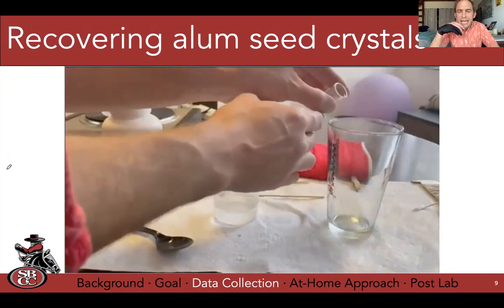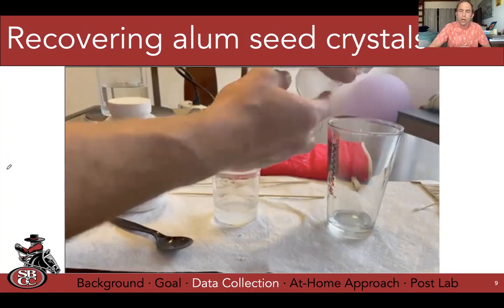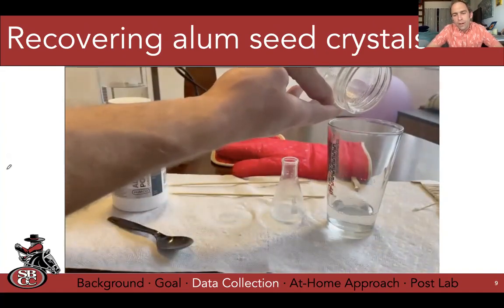So you'll want to just decant out the solutions. You might choose to save those solutions later, so we'll talk about why. But so you can hold off on them.